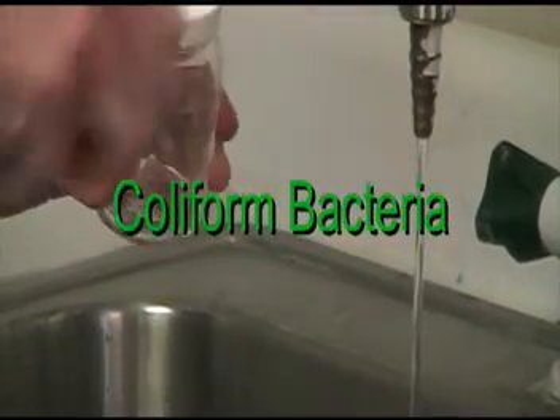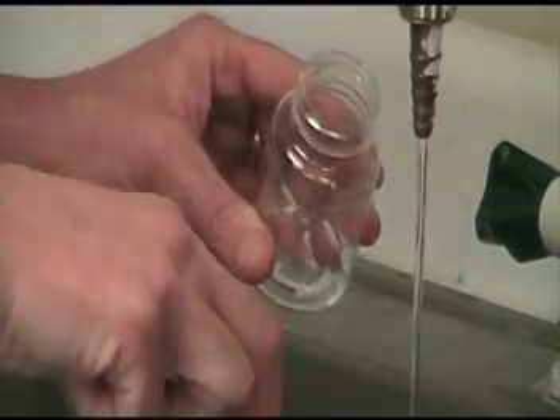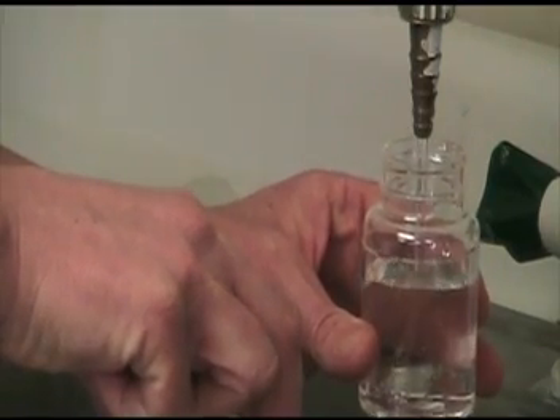Coliform Bacteria: Let cold water run for about 3 to 5 minutes. Remove the seal, then cap from the sterile vessel. Fill to the line, then replace the cover, remembering to use aseptic technique.